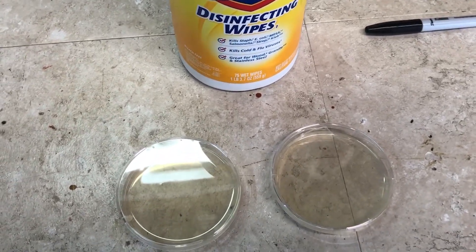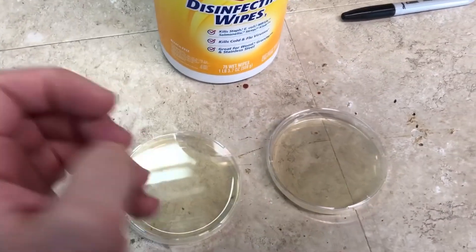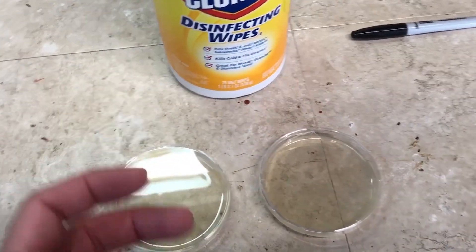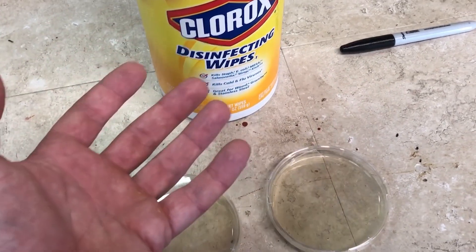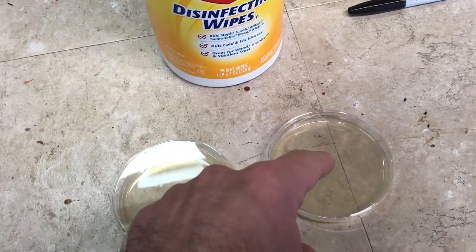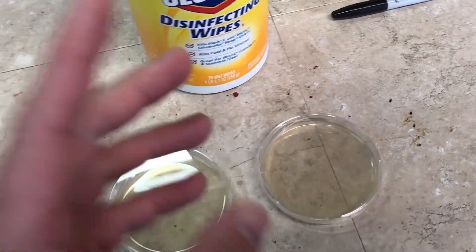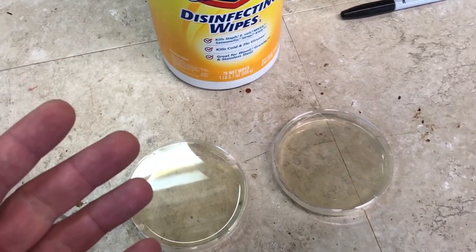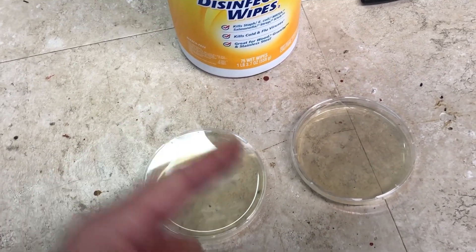I've got one more trick — two petri dishes left and some disinfecting wipes. I'm going to dirty my hands again, then use the wipes on my hands and touch the plates. Normally you wouldn't use these on your hands since they're for wiping surfaces, but it's pretty much the same thing. For the last plate, I'm going to swab surfaces after using the Clorox wipes on them to see if it actually does anything — since in a previous video about an ozone generator, I noted that nothing is 100% effective.